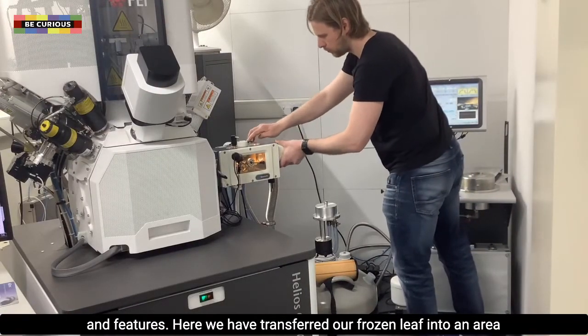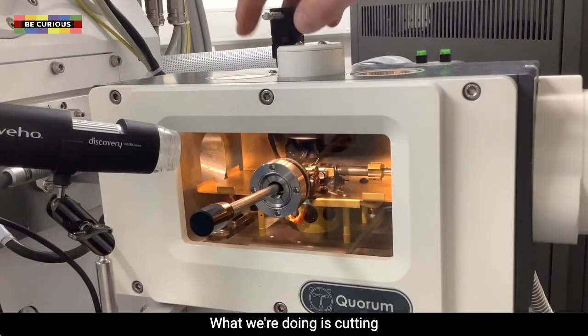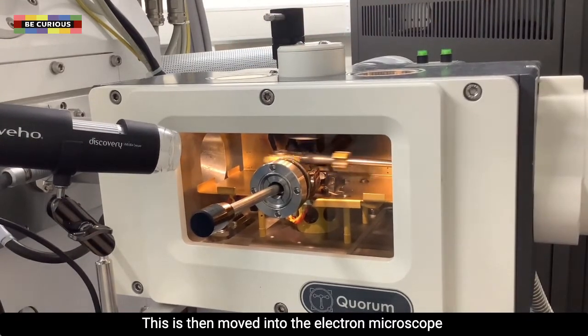Here we have transferred our frozen leaf into an area where we can prepare what is called a cross section. What we are doing is cutting through the frozen leaf with a sharp blade to expose the inner part of the leaf. This is then moved into the electron microscope.